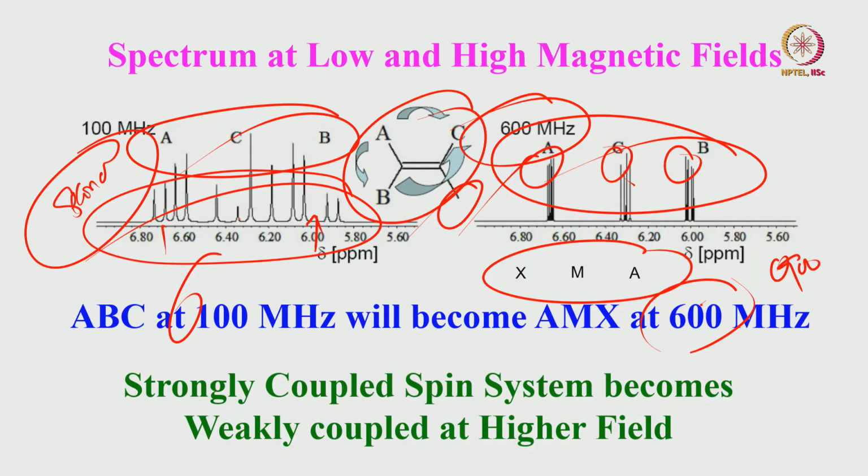This is what I just wanted to tell you about the Pople nomenclature and spin coupled systems, and I took the example of the 3 spin case here, AMX. But if you take ABC, what will happen? You will not get 12 peaks, you will get 15 peaks. There is no way you can analyze it in a straightforward way.